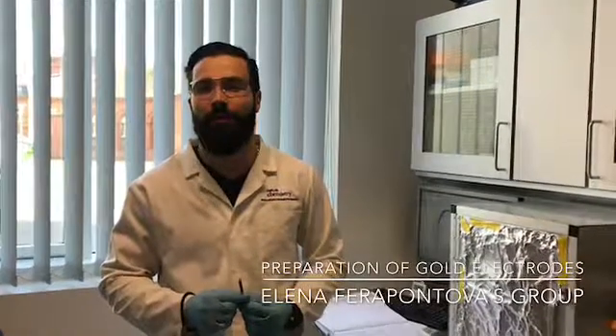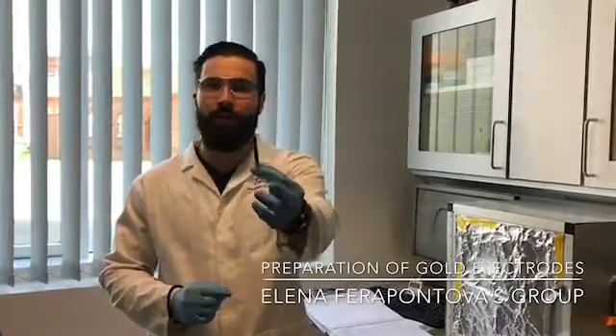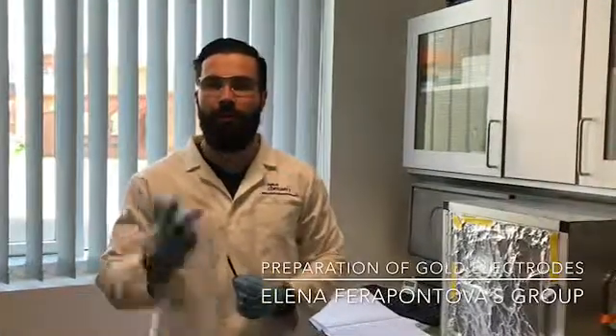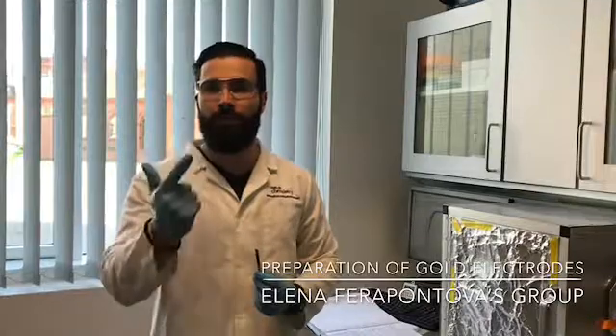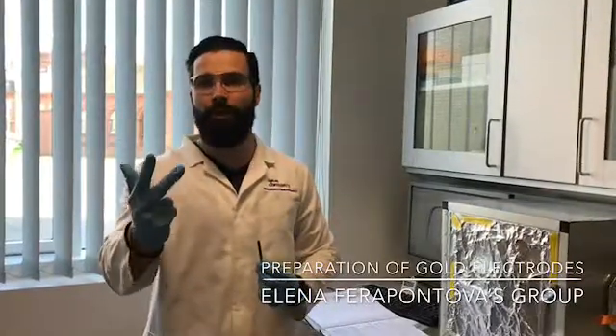Hi, I'm Laslo and this afternoon I'm going to show you how to clean properly a gold electrode for DNA deposition. What you need to know is that there are three steps involved in this process: step number one is the electrochemical cleaning, step number two the mechanical polishing, and step number three is the electrochemical polishing.